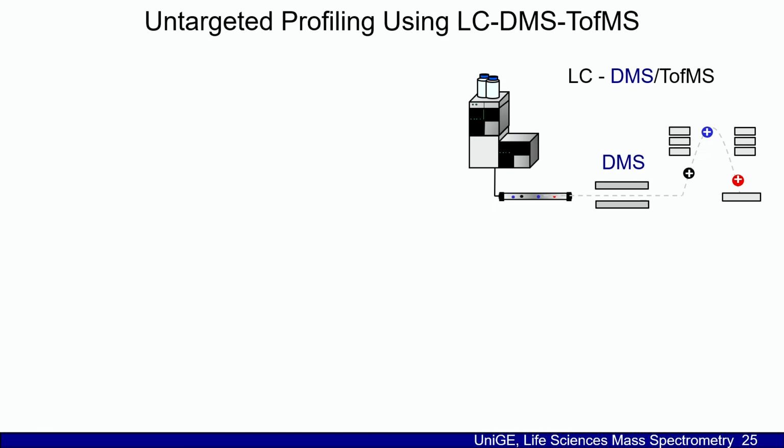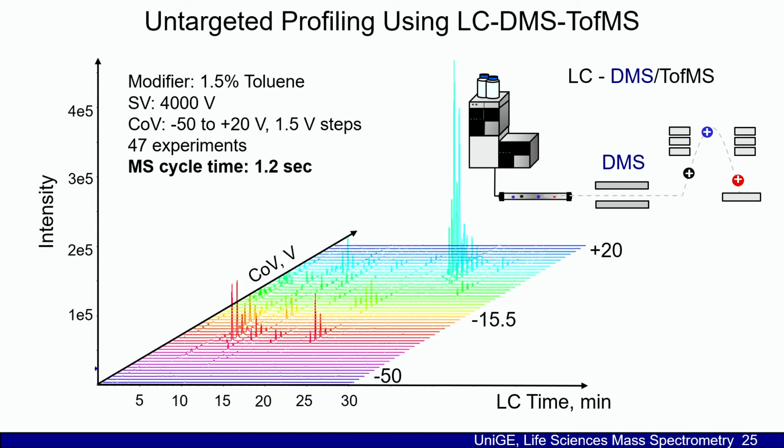The point in untargeted profiling is to get as big a peak capacity and separation as possible in order to see everything. So preserving the performance of the chromatography and then expanding in the second dimension with a high degree of orthogonality to separate as many features or analytes as possible.